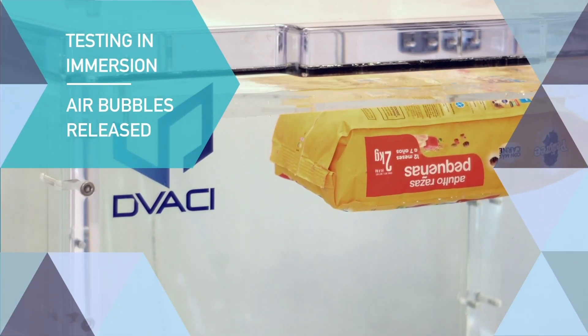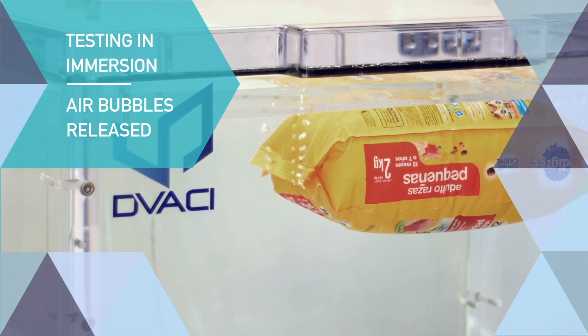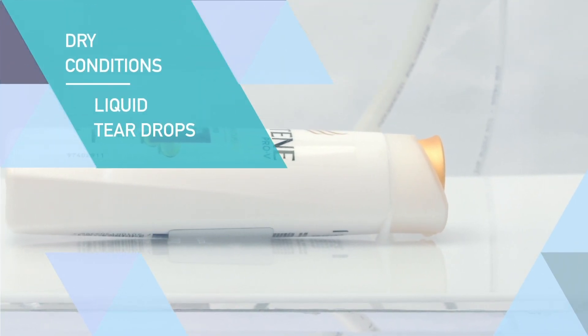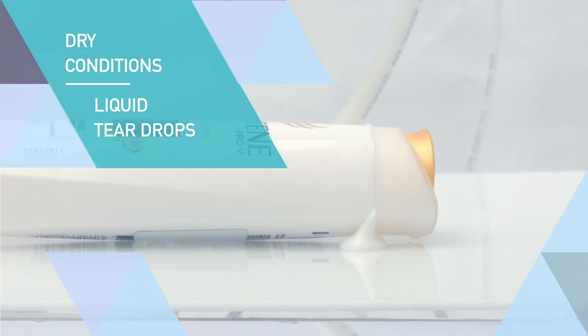CDV will allow the operator to see air bubbles released from the leakage when testing in immersion. Liquid products can be tested in dry conditions. Liquid teardrops will appear in case of a leaking issue on the tested specimen.